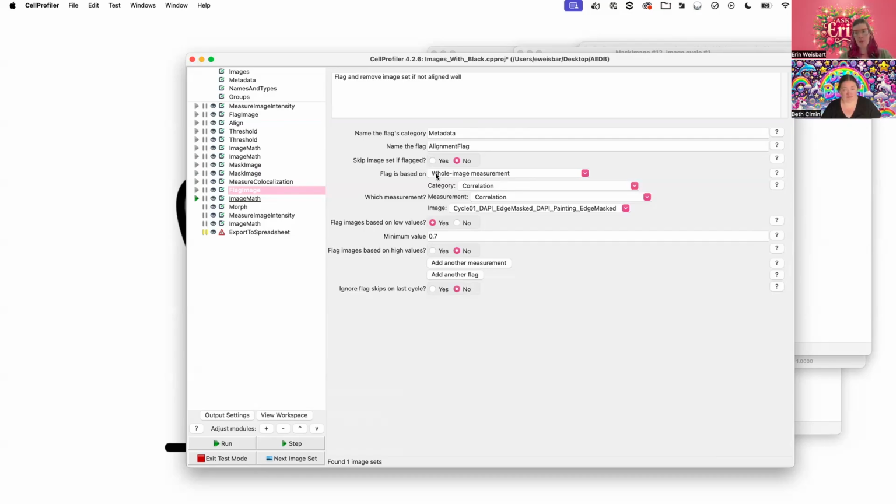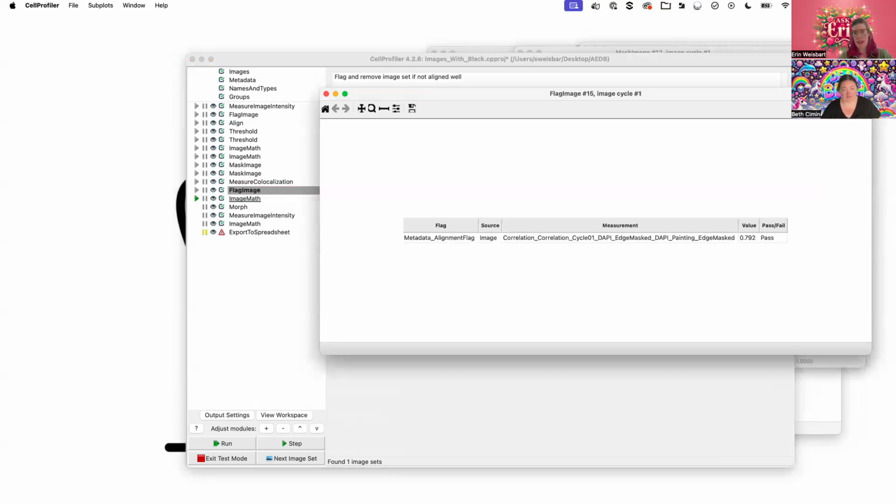So this can be really helpful for any sort of downstream data analysis and filtering that you might want to do. Your first thing might be go look at images that are poorly correlated after they've been through alignment. And it's quite possible that they did align nicely, but they're poorly correlated because there was a piece of debris in the corner of one image or something like that.